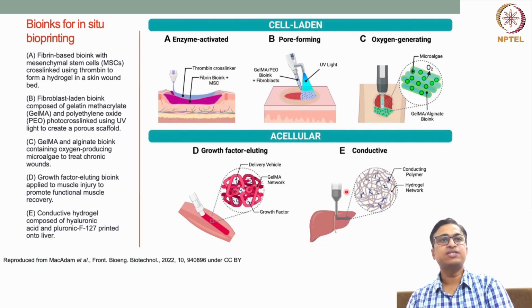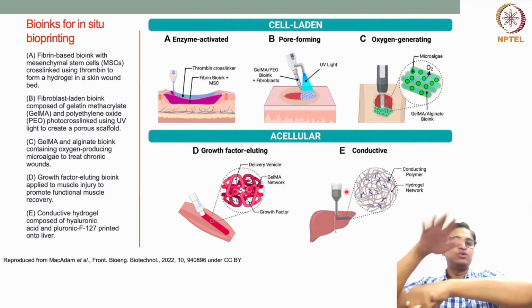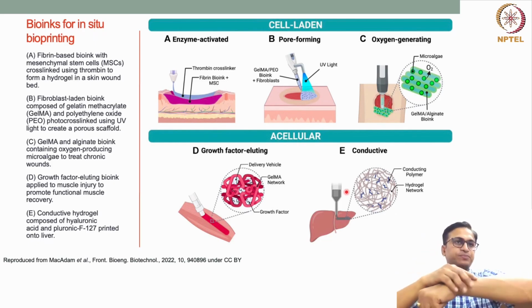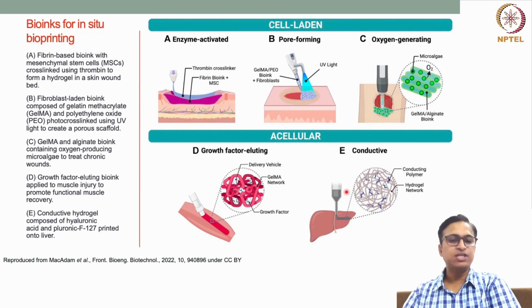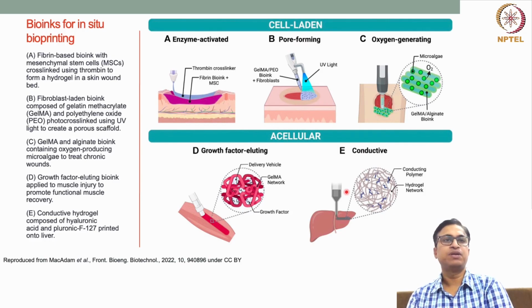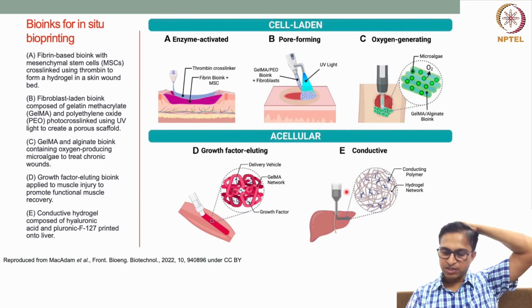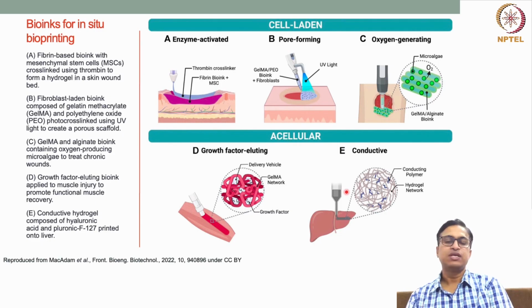Again, laser-assisted bioprinting can also be employed, and there also we can use different types of bioinks. We know that when the laser light is on, droplets are generated from the ribbon and deposited on the substrate. Using laser-assisted bioprinting directly on the wound bed, we can deposit cell-laden hydrogel. There are various types of materials. In one such application, people have printed hydroxyapatite slurry directly on a bony wound bed, the calvaria bone of an animal.